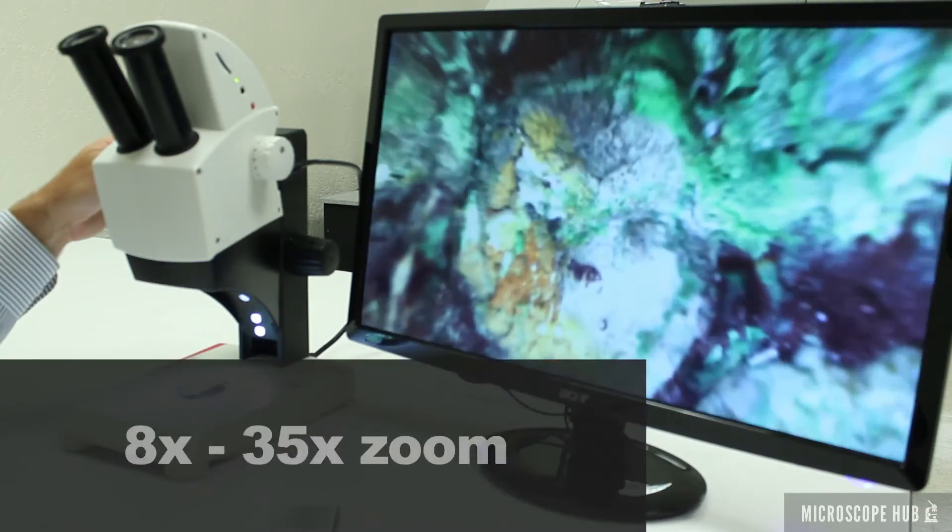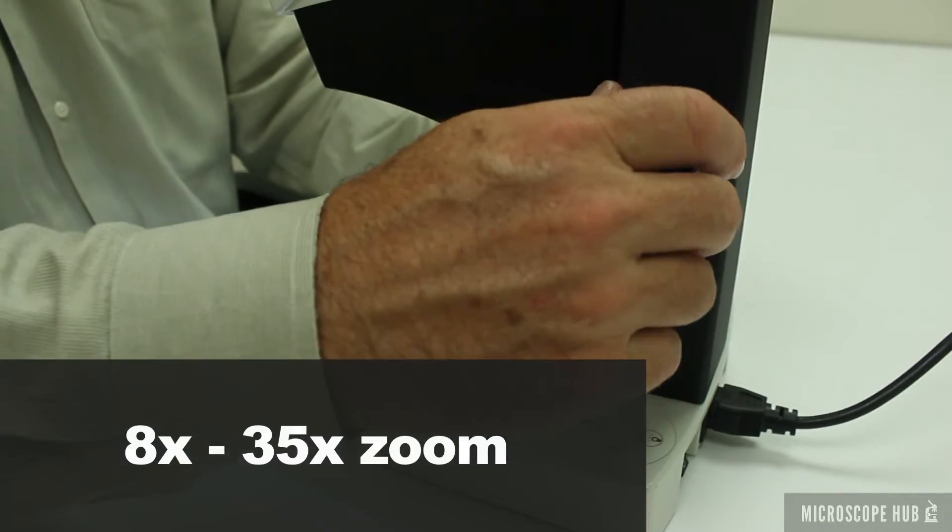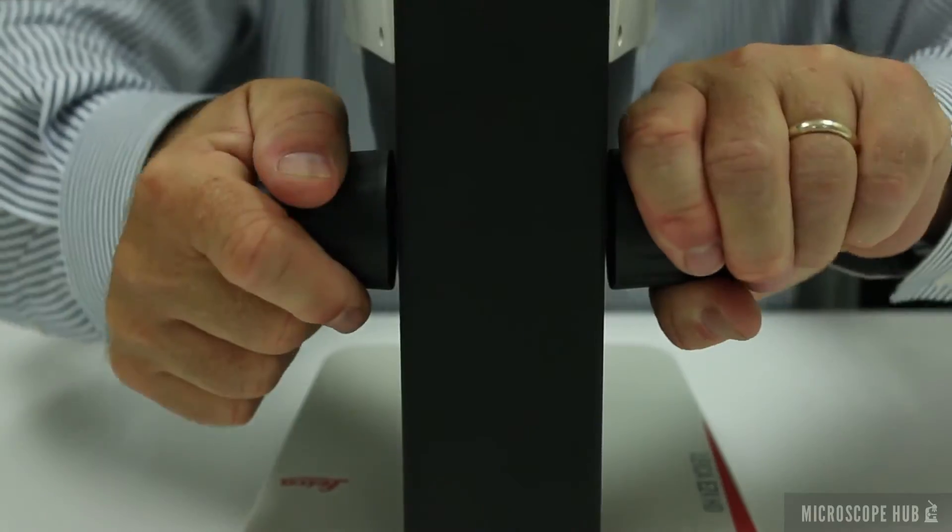It has an adjustable magnification knob for zooming in and a comfortable focus knob with tension adjustment.